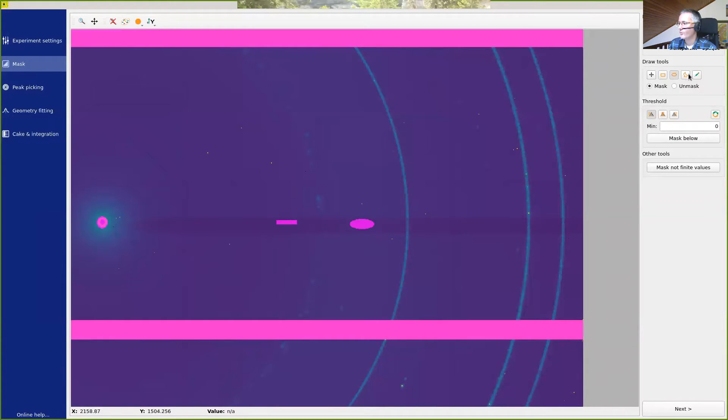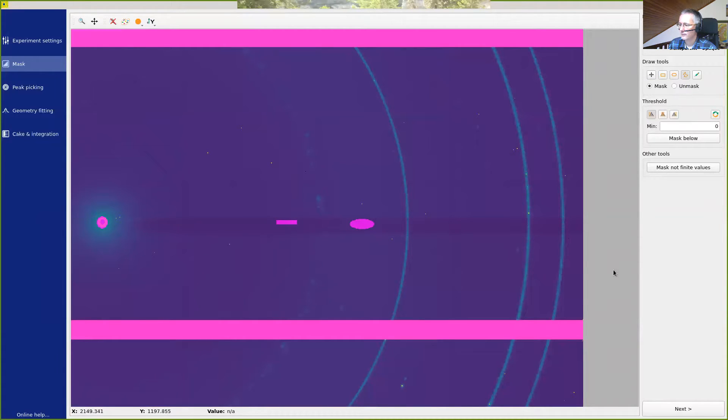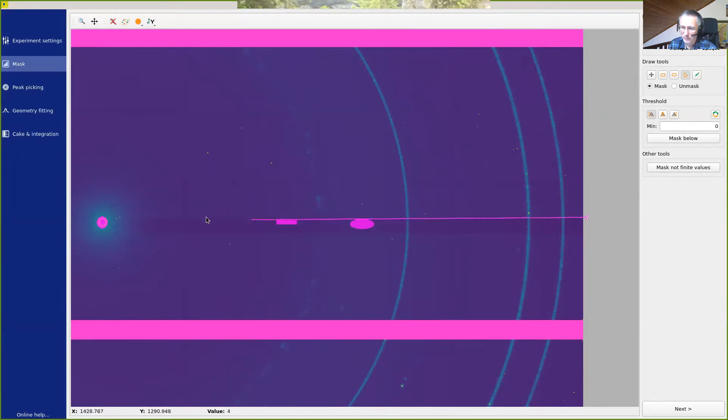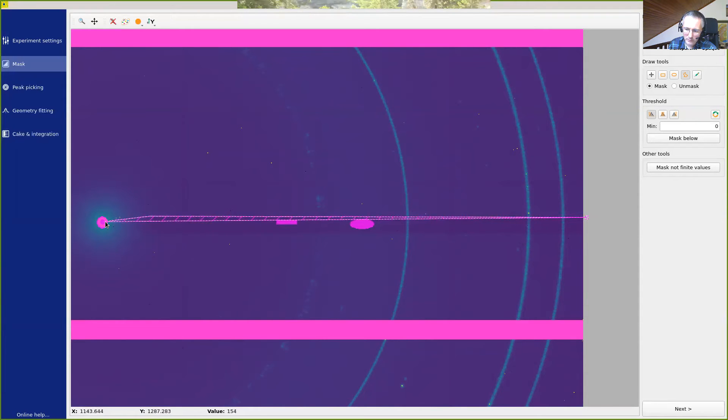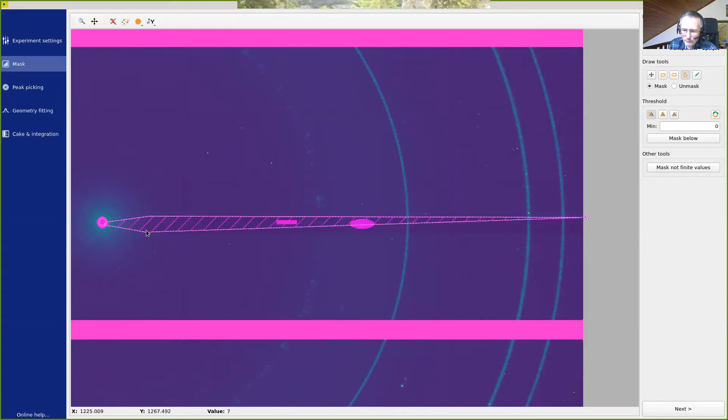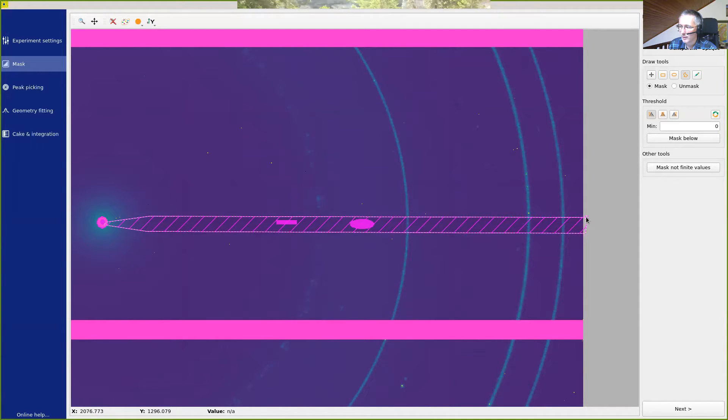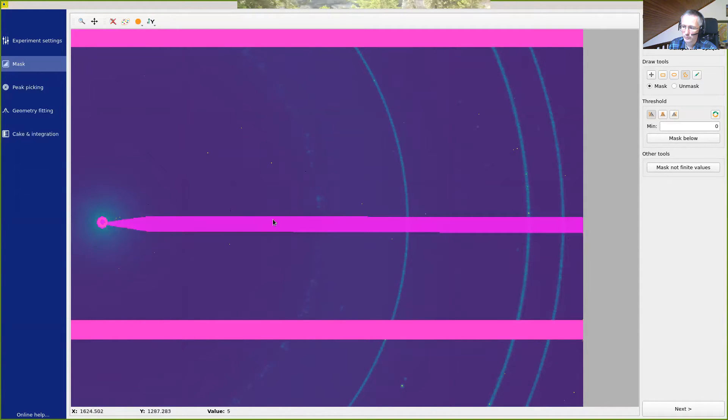The most useful tool, I think, is the polygon selection tool here. This allows us to draw a polygon. When we click first on the image, we see a small square appearing at the position of the first point. Then we can just go on drawing the polygon. And once we are finished with it, we go back to this first point, and we click back on this first point, and this will finish the selection of the polygon.